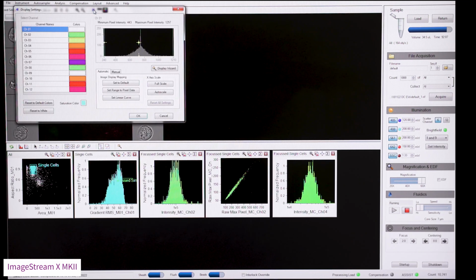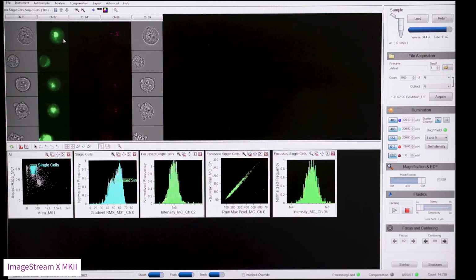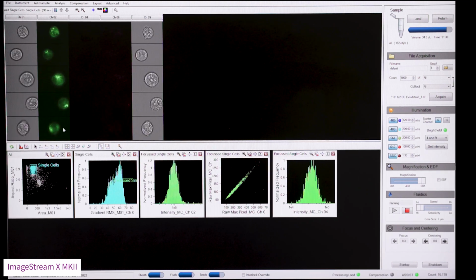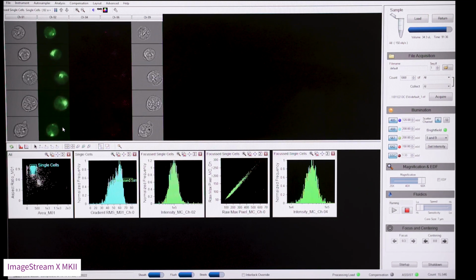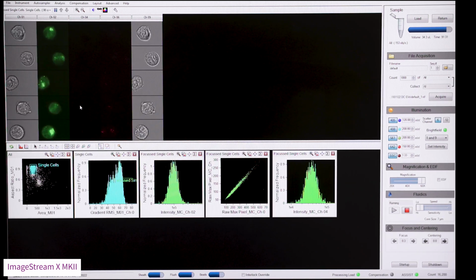Once open, we can click on Channel 2 for FITC and adjust the maximum and minimum intensities. Move the left-hand vertical line to the left-hand side of the histogram and move the right-hand vertical line to match the highest pixel intensity in the image. Press OK and you will see that we can now see the green of the FITC. These cells don't have any propidium iodide, so you can't set up those display settings yet.